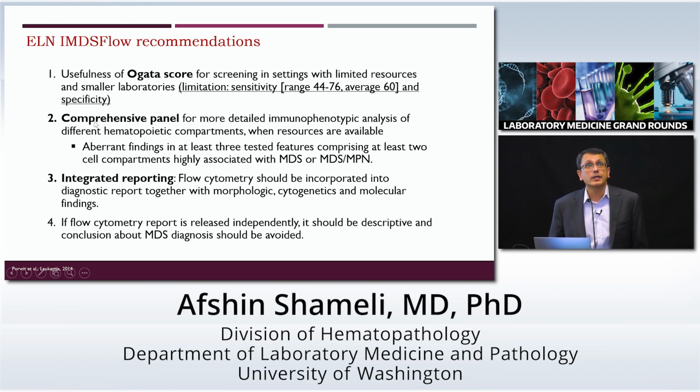They advise the use of a more comprehensive panel for more detailed immunophenotypic analysis of different hematopoietic cells. And they indicate that the presence of at least 3 aberrant features in at least 2 cell compartments is highly associated with MDS and MDS-MPN.